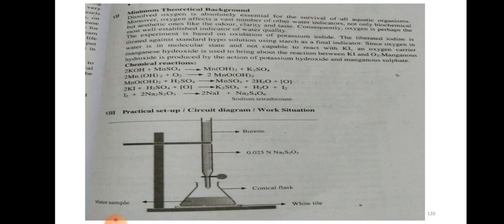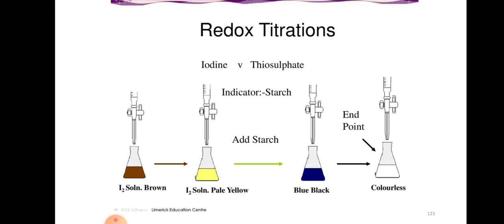Here we are using the burette. Burette is filled with 0.025 normal Na2S2O3, that is sodium thiosulfate. In a conical flask we are going to take a water sample. How we are going to perform the redox titration? Here first we will see the brown color solution is there. Why brown color? As iodine is liberated.